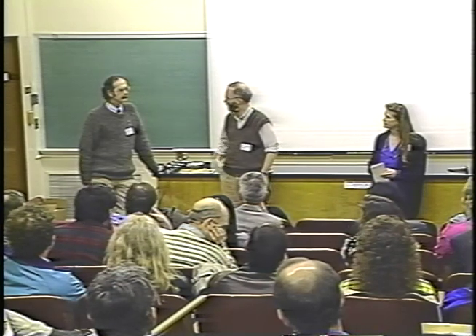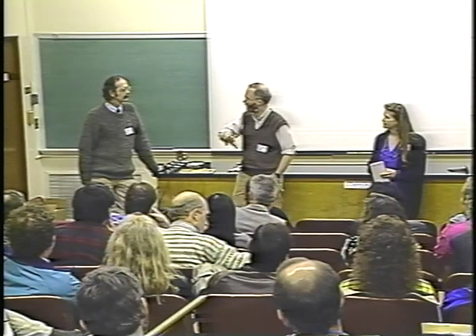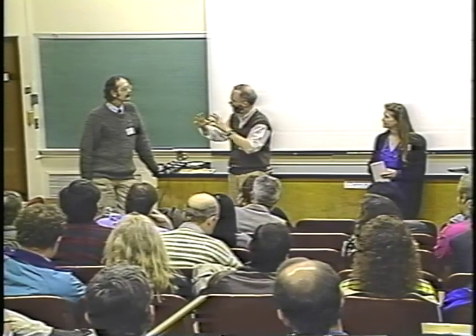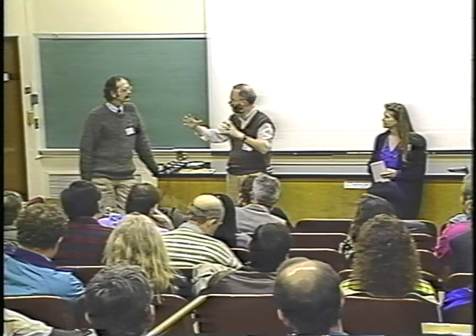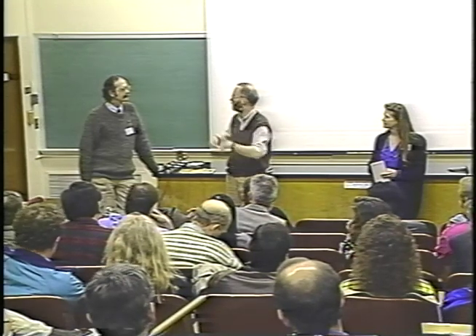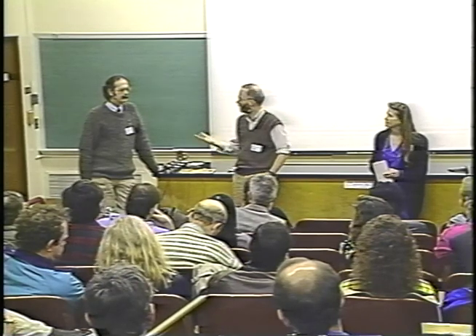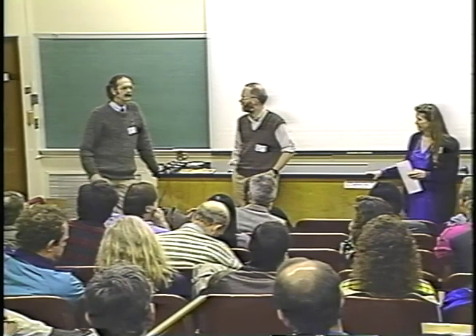You're doing particles at a certain spacing, but in principle, the closer they got, it would increase your resolution. Is there a theoretical limit as to how you could do that? No. Is there a strategy you could use to do that?